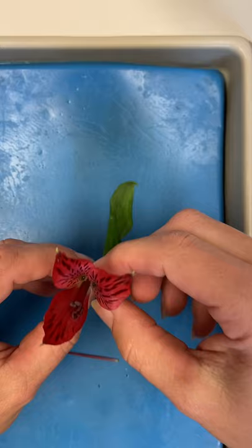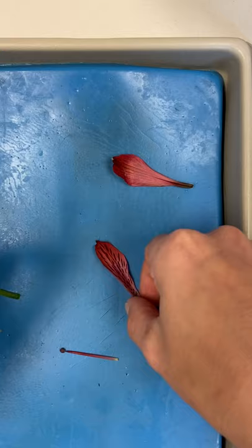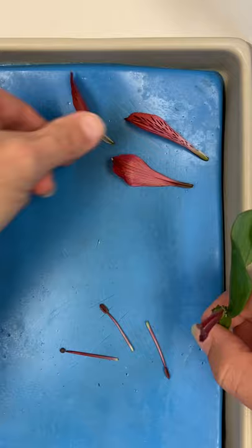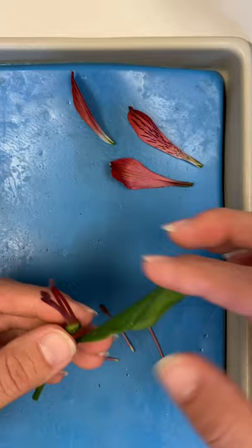Now we're looking for the petals — that's going to be these three structures. Petal number one, petal number two, and petal number three. We had three petals, and they're a little bit more decorative. Remember that the purpose of the petal is to attract the pollinator.